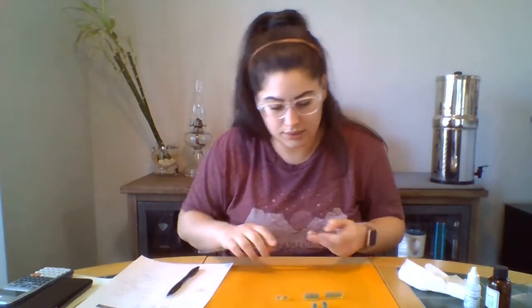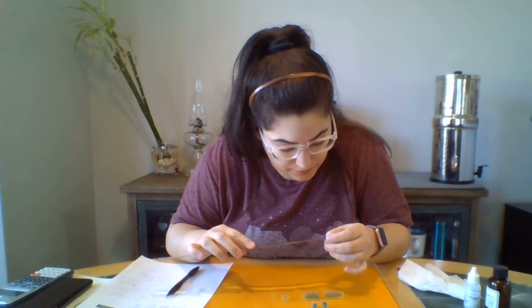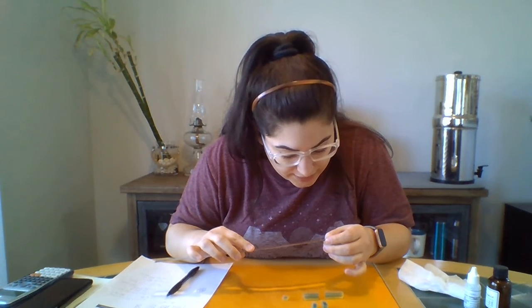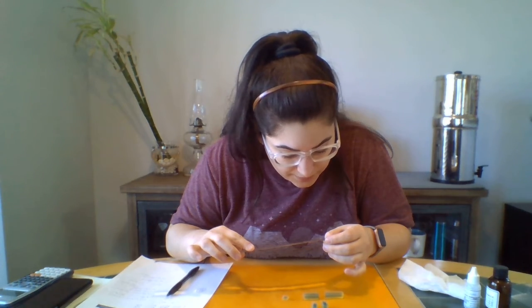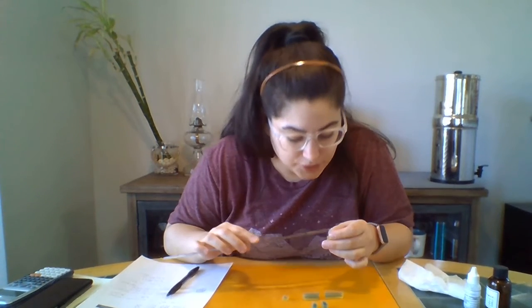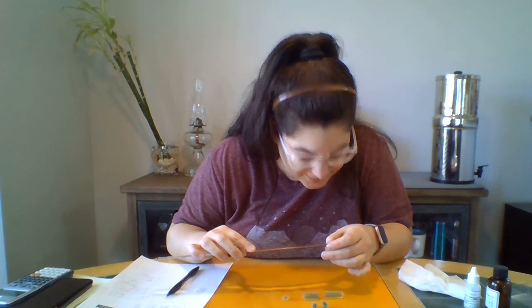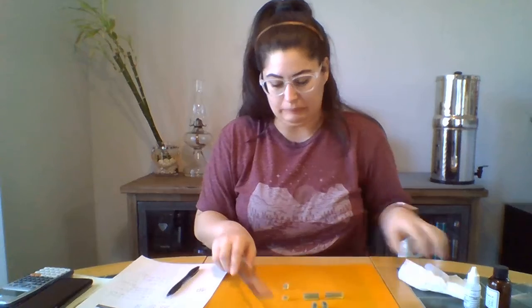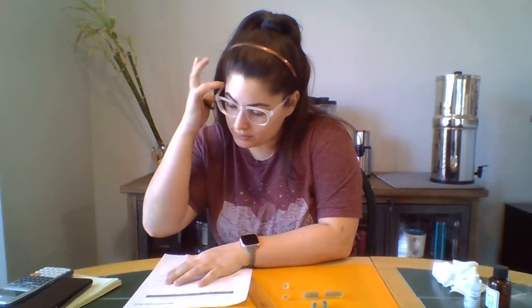Distance of diffusion. Let's start with the one first. So I would say about 1, 2, 3. About a quarter of a centimeter, 0.25. Yeah, it really is. 0.25, that's pretty exact. Okay.